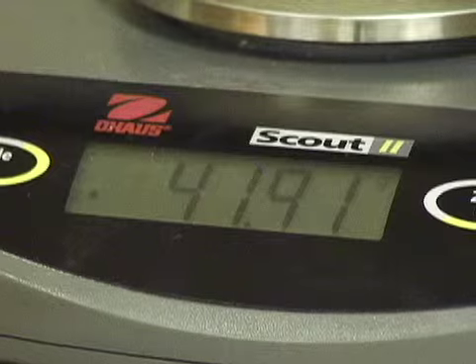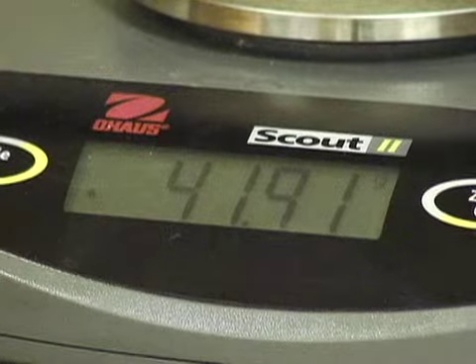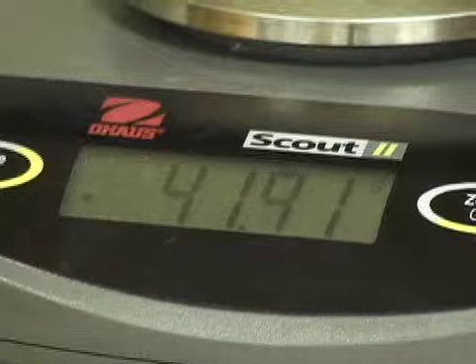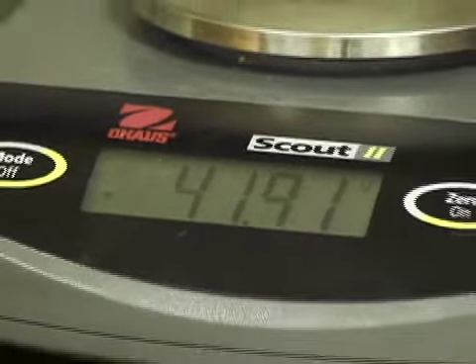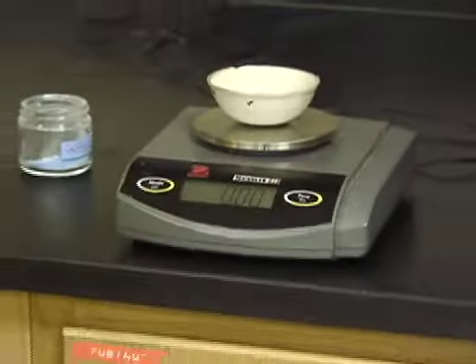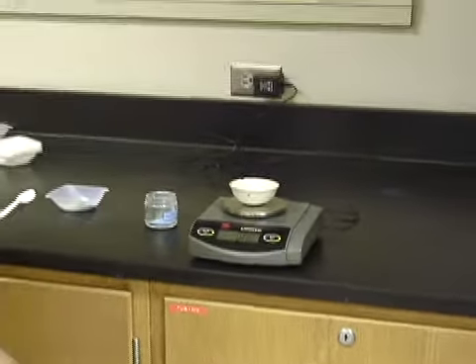So here I have my balance, and it's set to 0. I'm going to weigh out an evaporating dish and find the mass of the empty evaporating dish. And it is 41.91 grams. 41.91 grams is the mass of my empty evaporating dish. Now I'm going to set this to 0 because I'm going to weigh out exactly 2.00 grams of my hydrated crystal.